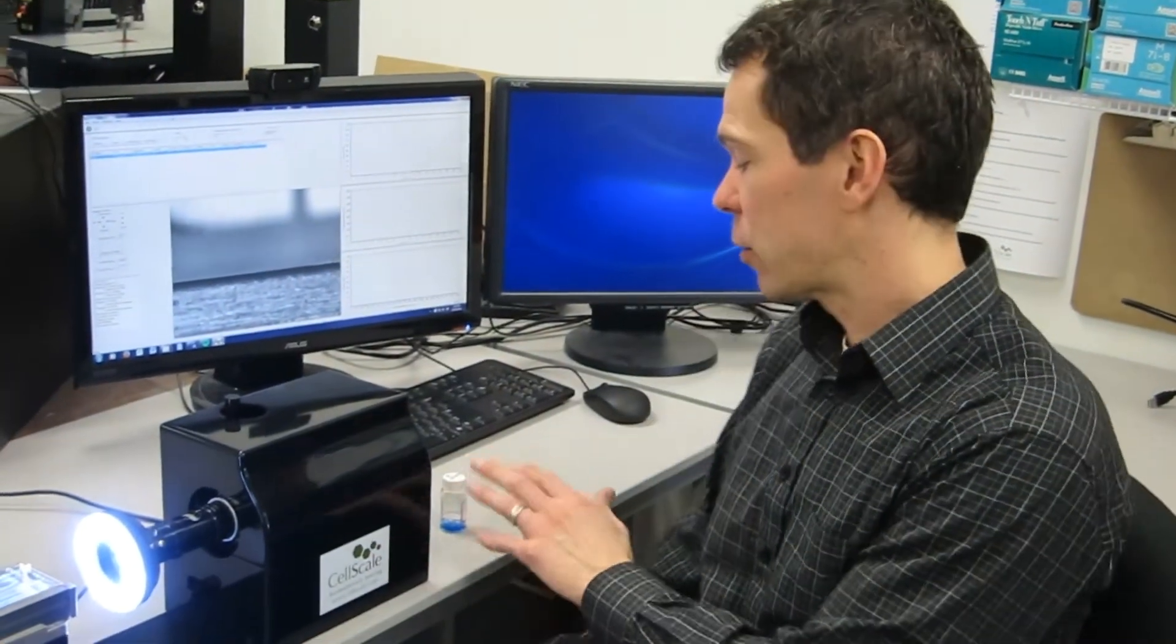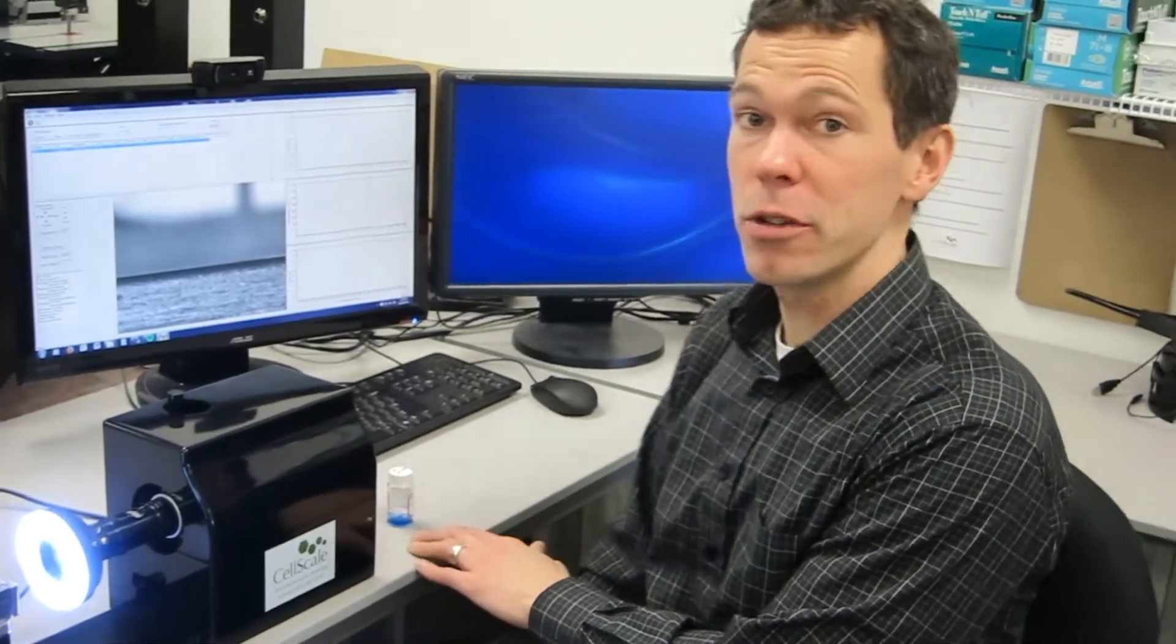Hello, my name is Caleb and I wanted to take a few minutes this afternoon to show you some techniques to use the CellScale Micro Squisher system with some microspheres of hydrogels.